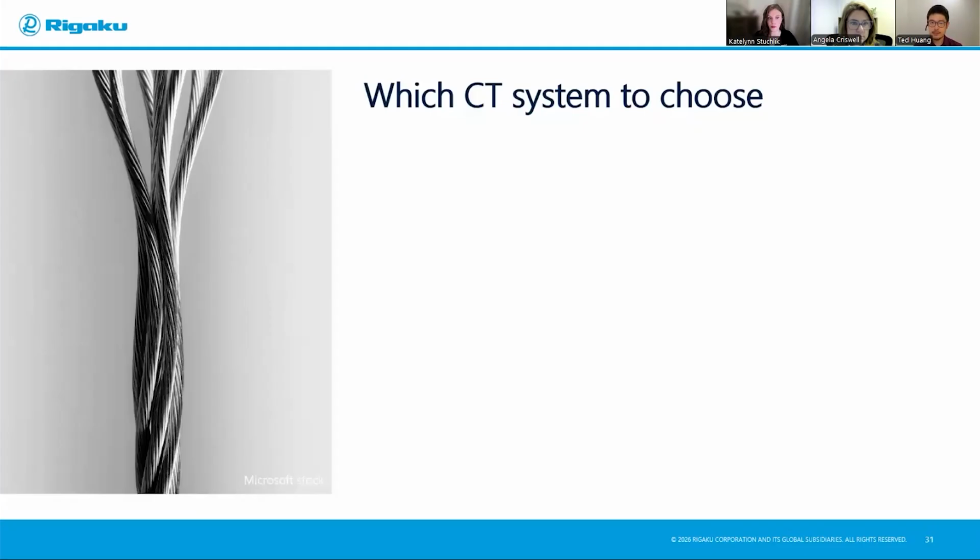So which CT system to choose? What are the questions you need to ask, or the things you should take note of? The first thing you need to know is that there's a FOV, field of view, versus resolution balance in a CT system. I'll talk about what FOV is, and we'll go more in depth in just a moment.